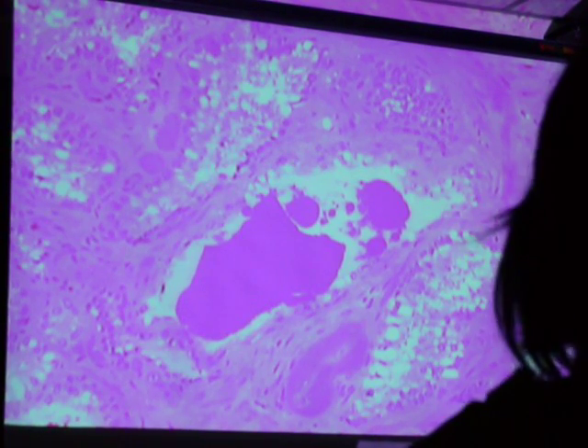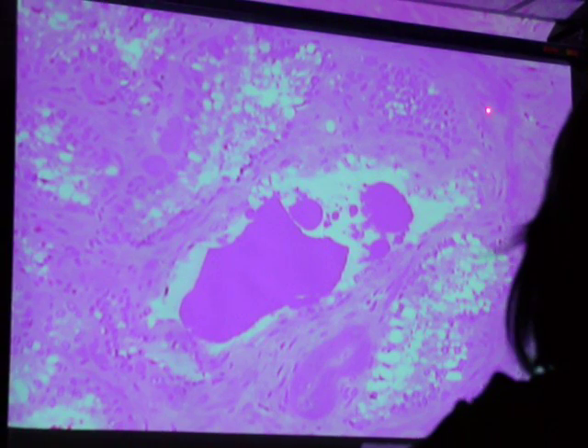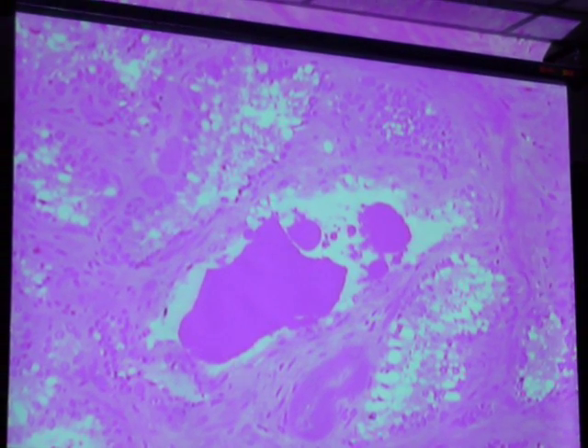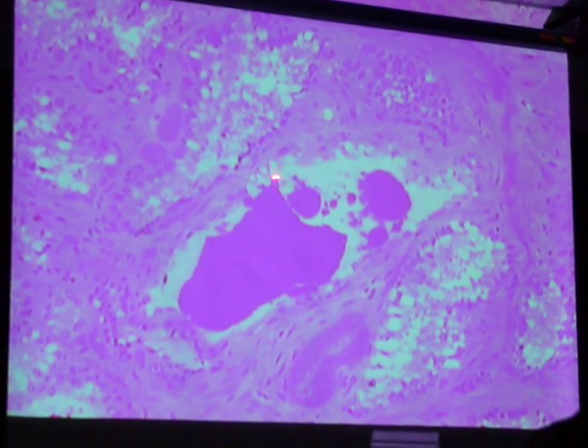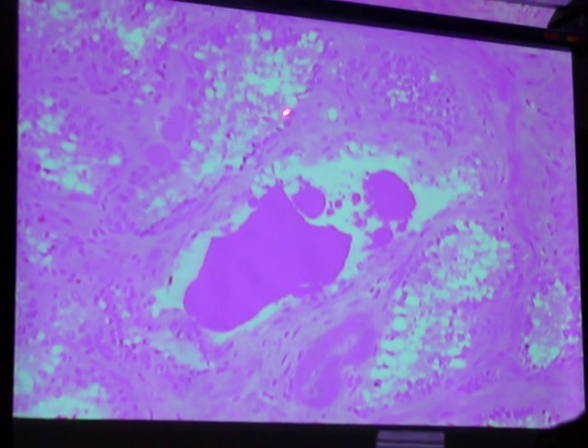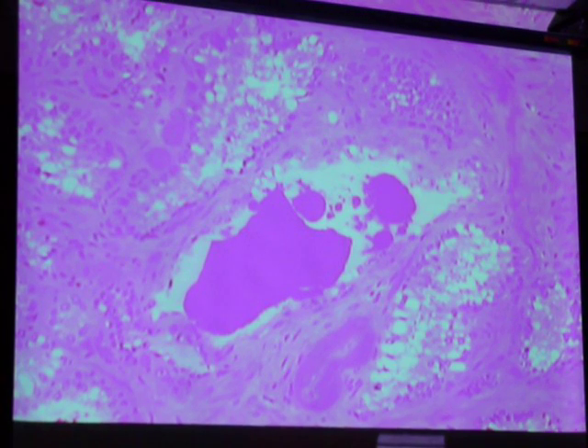So this would be a fair shot of the prostate here. This is all smooth muscle, dividing all these glands up. This is that prostatic concretion. If I'm going to show you prostate, you're going to see some big pink lobule gunk in the open space — that's the prostatic concretion. We have to see the smooth muscle. Glandular alveoli — that's what the cells lining these spaces are called — and these are secreting all the components of the seminal fluid.